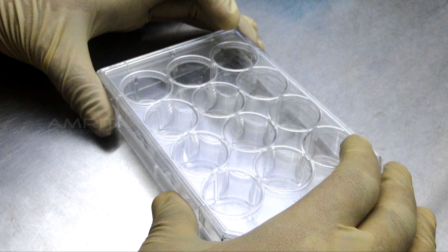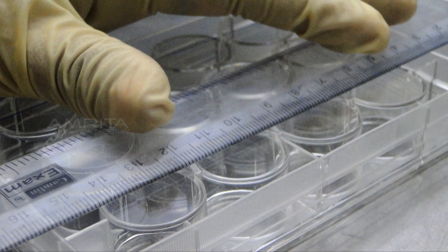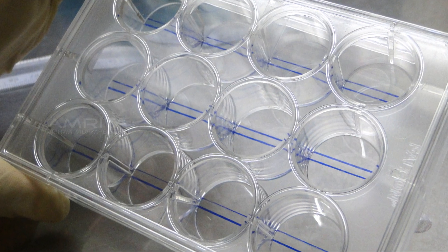Procedure. Take a sterile 12 well plate. Take a marker and draw horizontal lines at the base of the plate by inverting it.